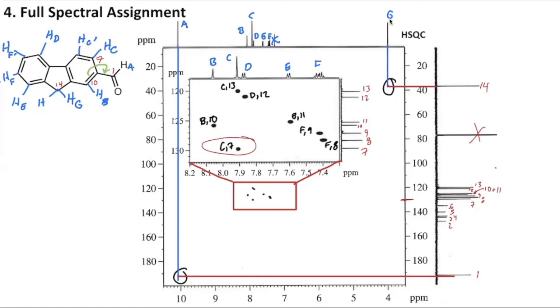We can bring that double bond outside of the benzene ring and go up to a negatively charged oxygen, which demonstrates the withdrawing nature of the carbonyl group on a benzene ring. So position 10 and position 7 are going to be more withdrawn than, say, position 13, which must be here, which being meta to that withdrawing group is going to be much, much less affected by its electron withdrawing nature. Okay, so we've got an idea between those two, which one is which.